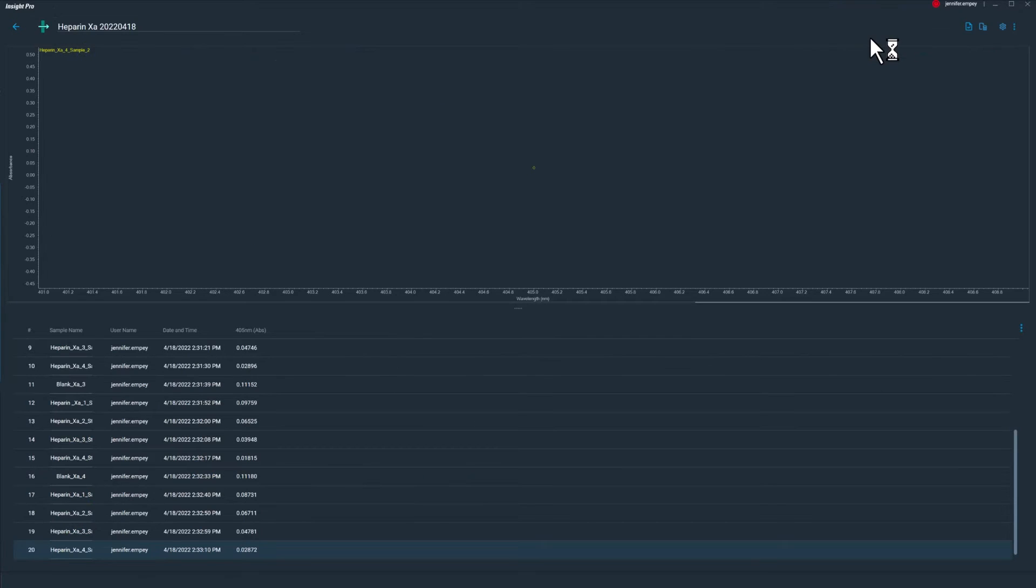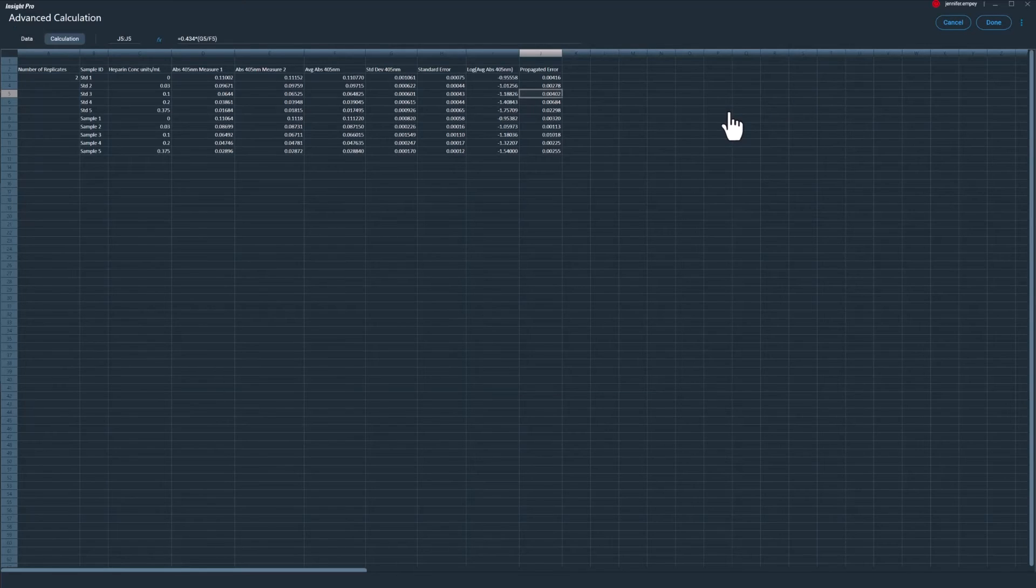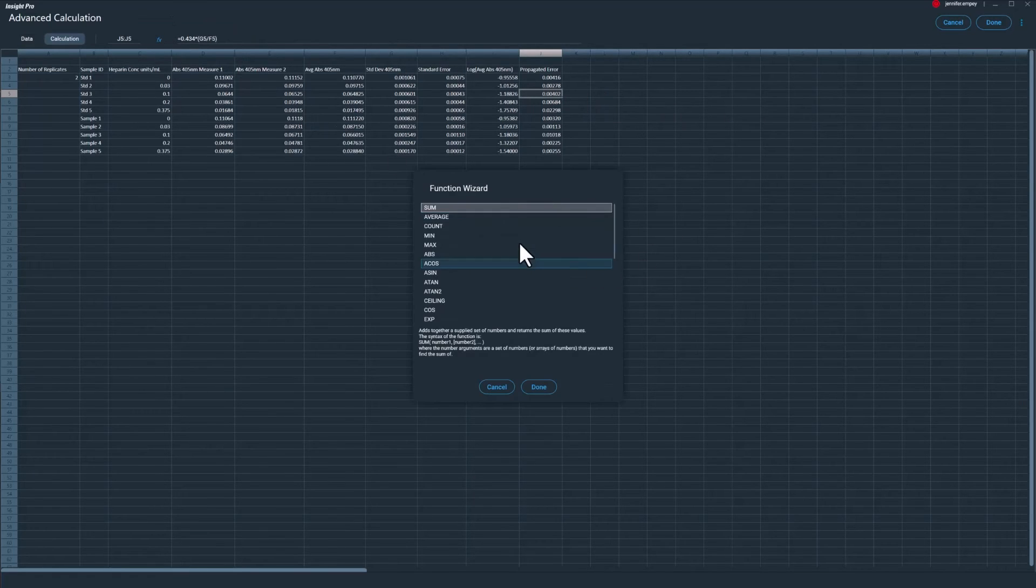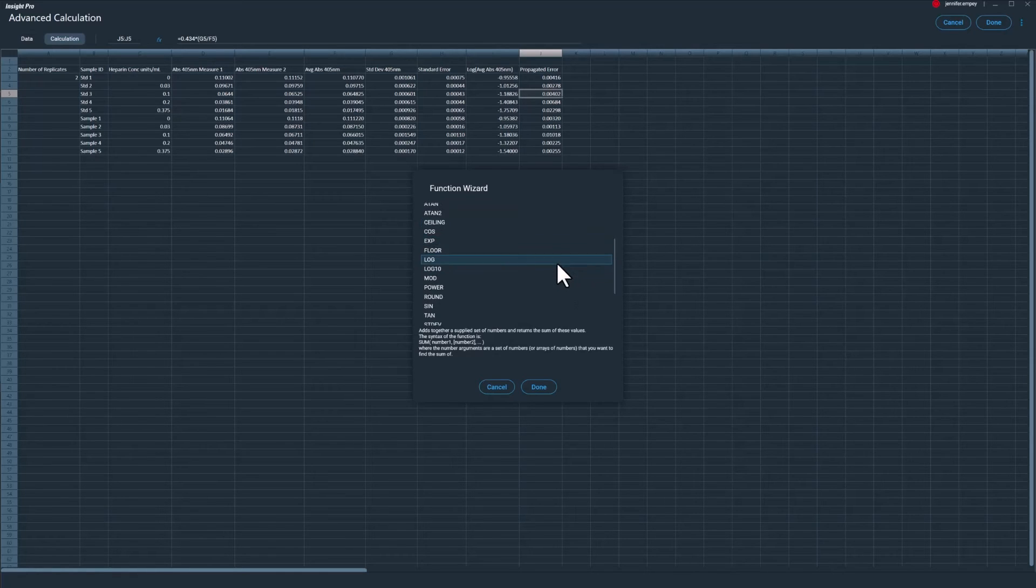For all available methods, the Advanced Calculations functionality can be used to further work up the collected data. Advanced Calculations features a spreadsheet format enabling users to analyze data using more complex mathematical functions including average, standard deviation, logarithmic, and trigonometric functions.